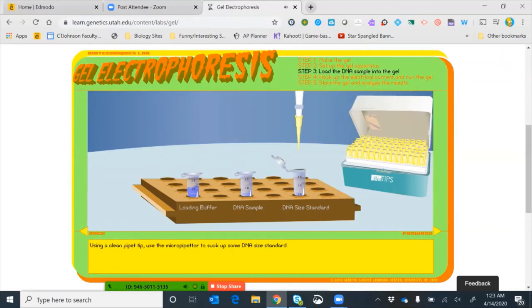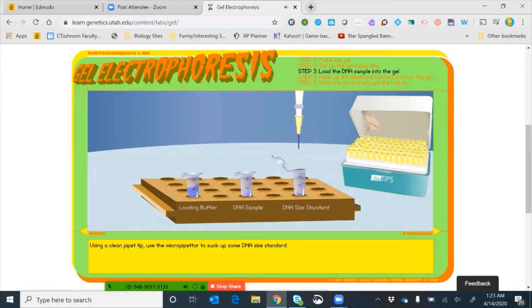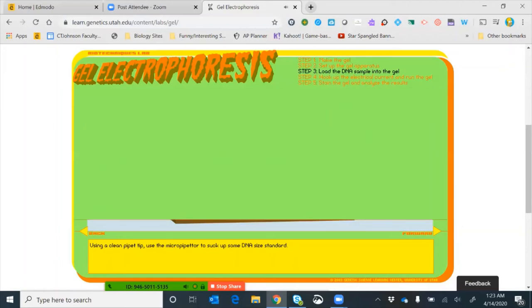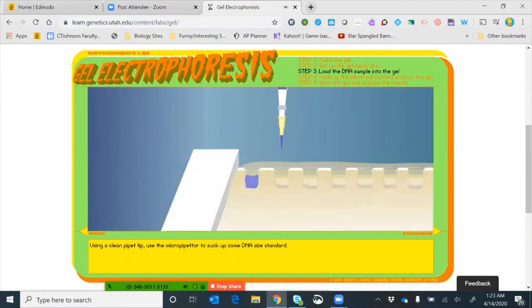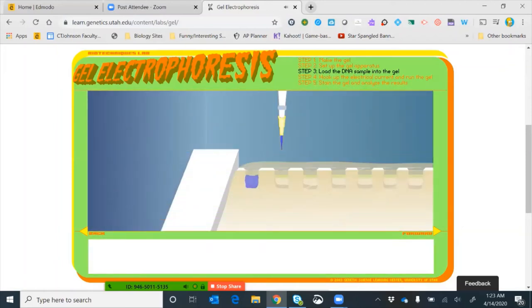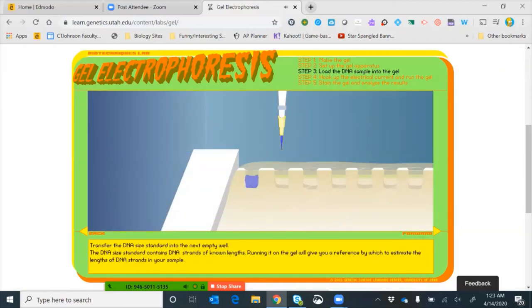We've loaded our DNA sample. Now we need to load our standard — the DNA ladder, our DNA size standard — into the second well.